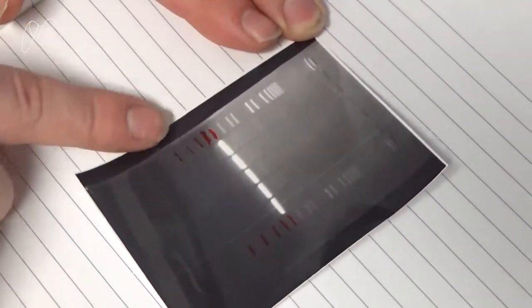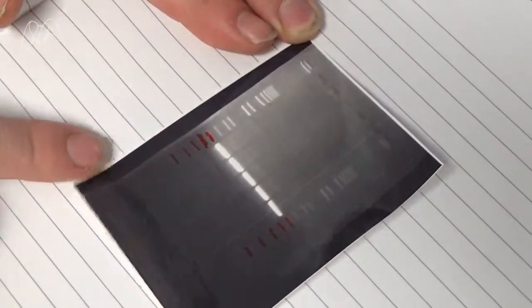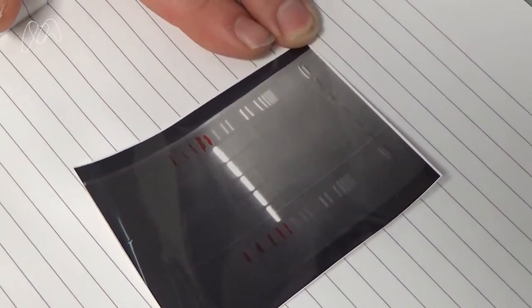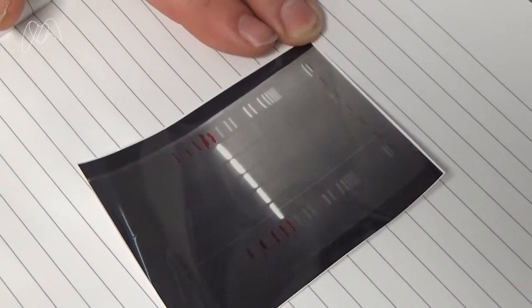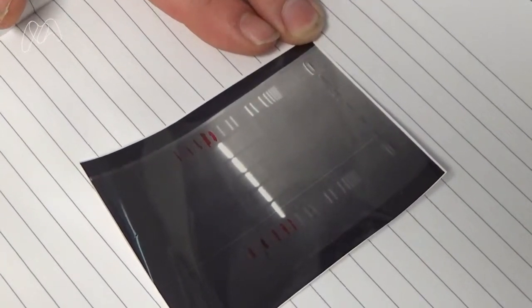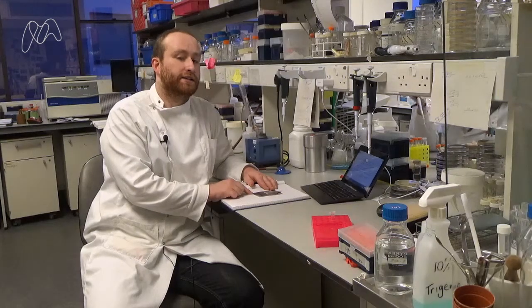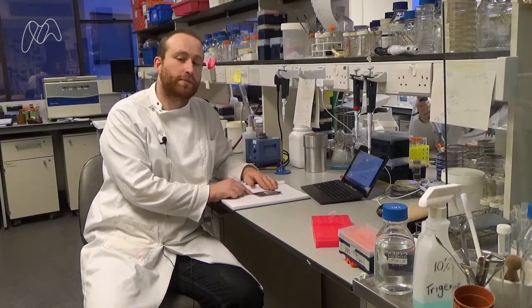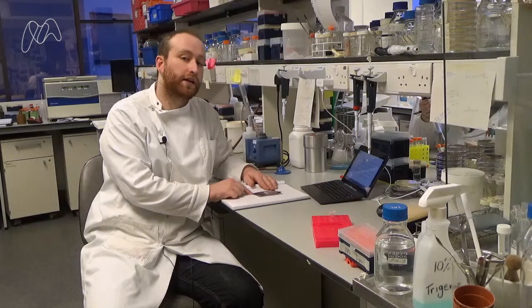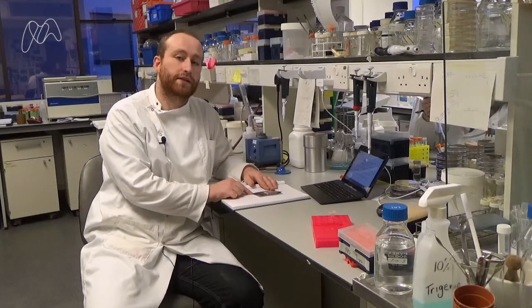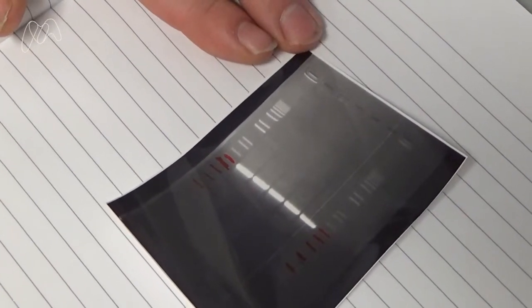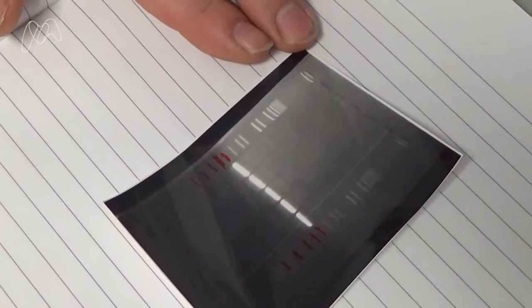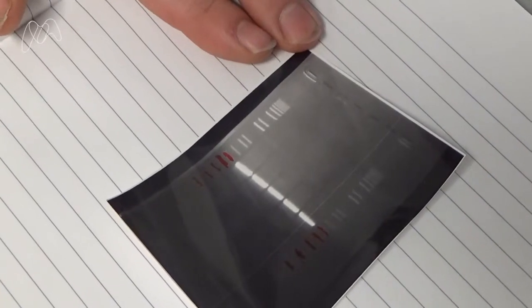Well, in this first lane, we run a special mixture of DNA that contains the fragments of specific known sizes. This means this first lane acts like a scale on a graph. If we compare the distances of our sample fragments to this scale, we can estimate the size of our PCR product. In the picture, the DNA from our PCR product seems to be around 500 base pairs, which is about the size we would expect for the gene we wanted to copy.